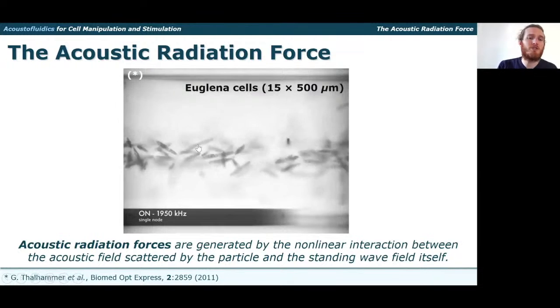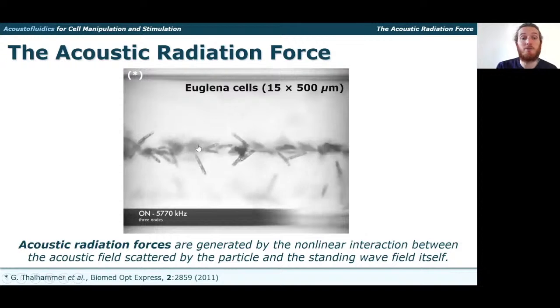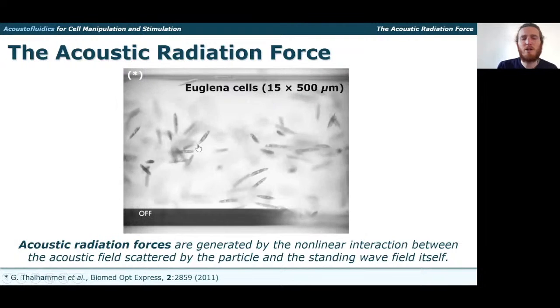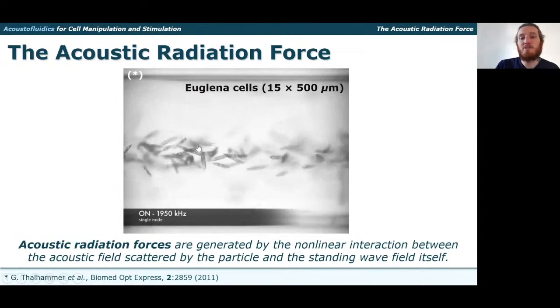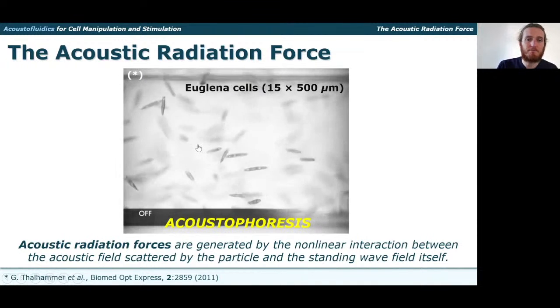Are the so-called acoustic radiation forces. These forces are generated by the nonlinear interaction between the acoustic field scattered by the particle and the standing wave field itself. And this ability of manipulating particles or cells using acoustic radiation forces forms the basis of a technology which is referred to as acoustophoresis.